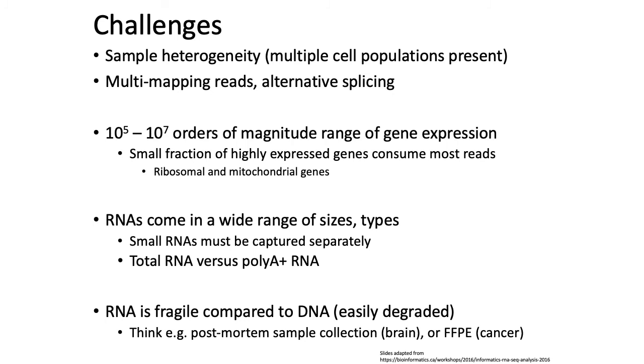It's worth pointing out that this is true even when you do things like FACS sorting to sort out cells that express certain cell surface markers, because there is basically no such thing as a set of cell markers that uniquely identify exactly one cell population and doesn't capture any other type of cell. Basically, you should assume that whenever you're doing bulk assays, there are always multiple distinct cell populations present, and the transcripts that you sequence are from a collection of distinct cell types.